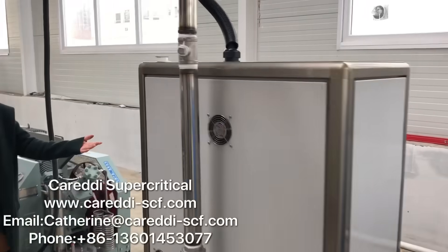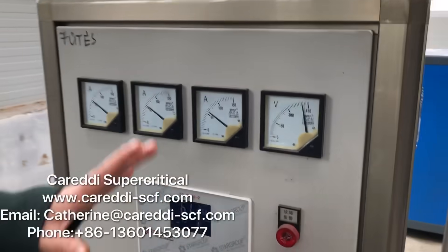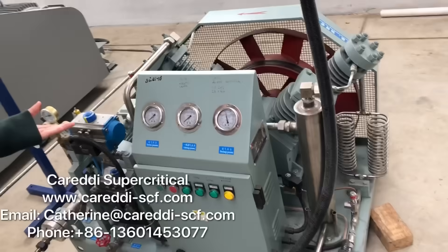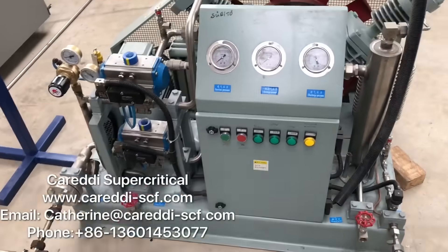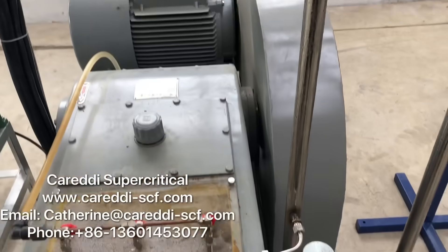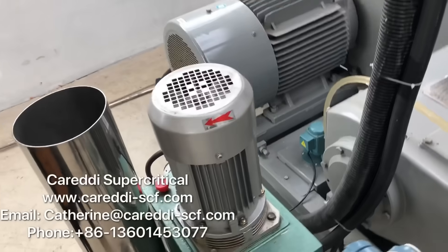This is the electrical water heater for heating the extractor and separator. This is the CO2 recovery pump. This is the CO2 high pressure pump. This is the co-solvent pump.